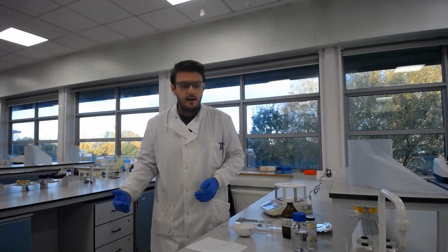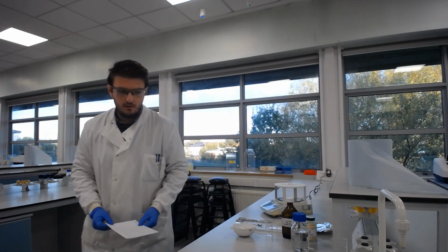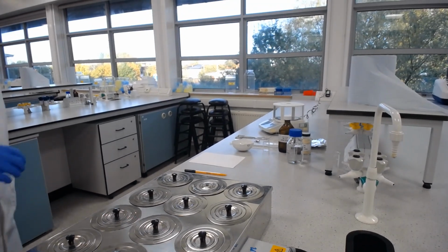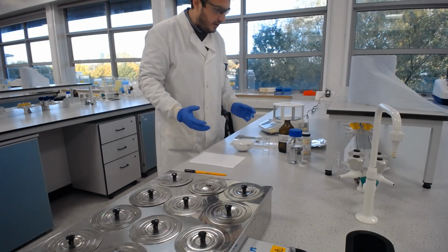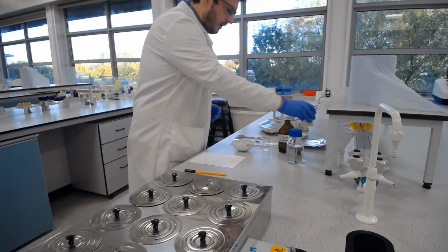But then there's a certain process by which we need to go through and do that, which I'll take you through now, and I'm just going to readjust the camera so that you can see what I'm doing. So you can see that I've got everything out here that I need to use. I've got my gelatin, which comes as granules like that.